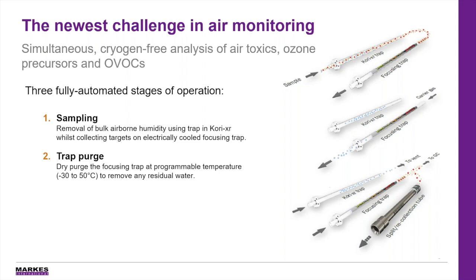Step 2 is the trap purge. Now, there might be some residual water that's come through with the compounds of interest. So at this stage, we can remove that by performing a dry purge of the focusing trap before the analysis.